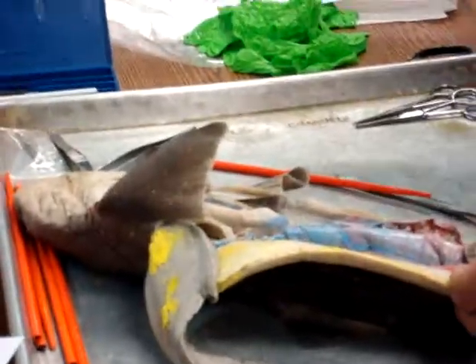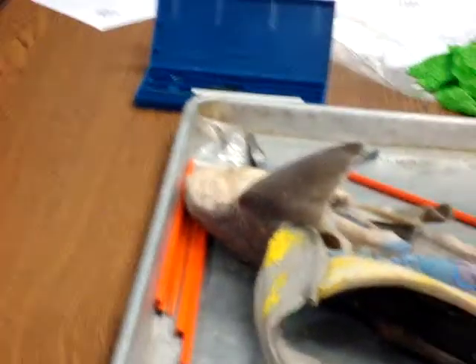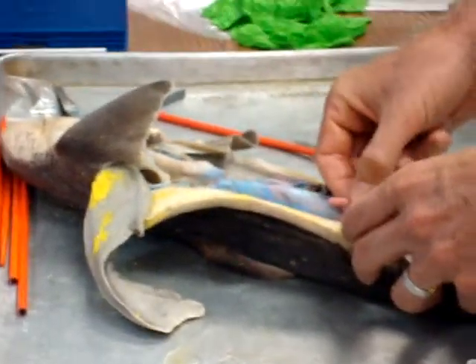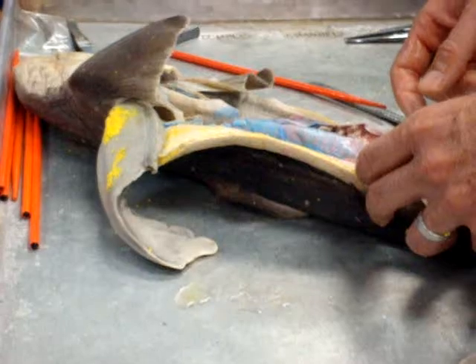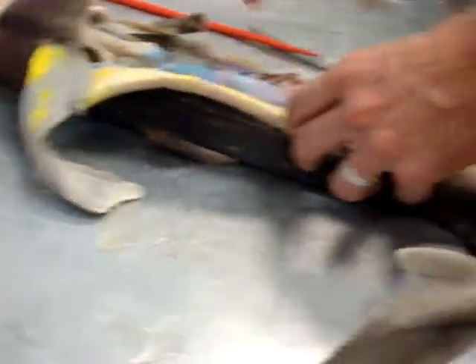So what would that V-shaped thing be? That's going to be part of the reproductive system, which we'll discuss shortly. Good. Rectal gland. So what does that thing look like inside? Rectal gland? No, it's just going to look like that. It's like a hot dog.